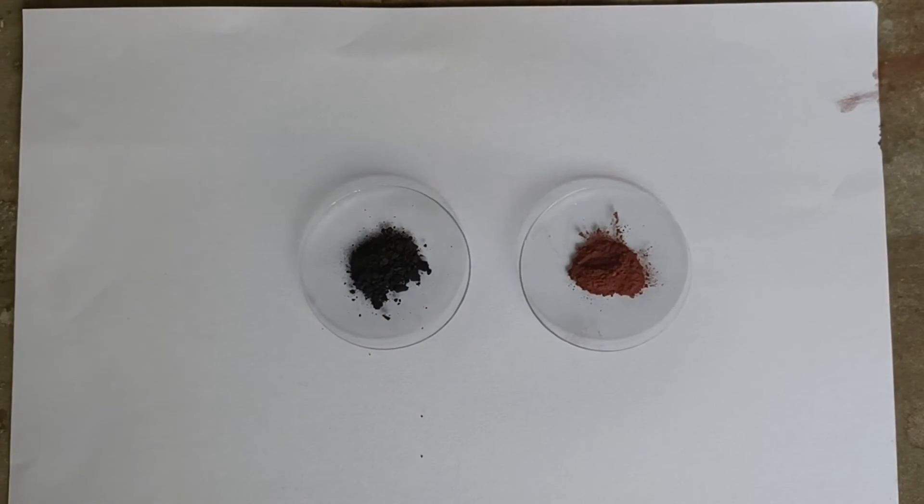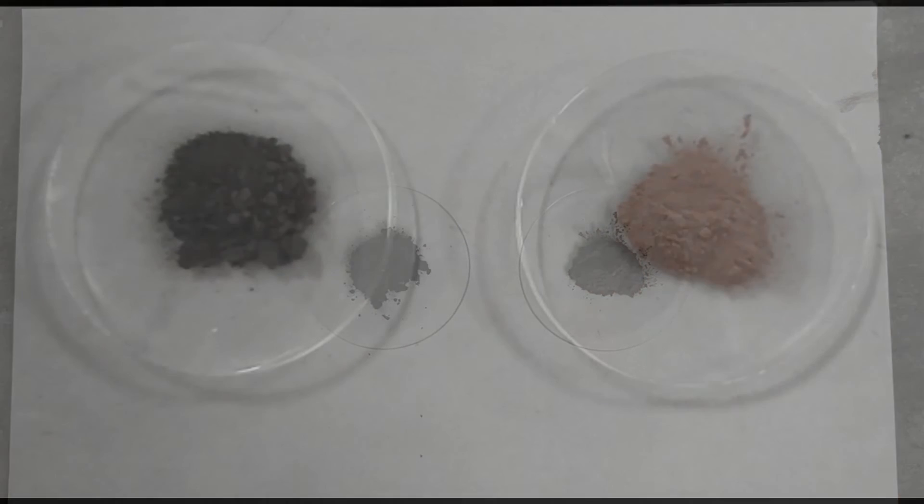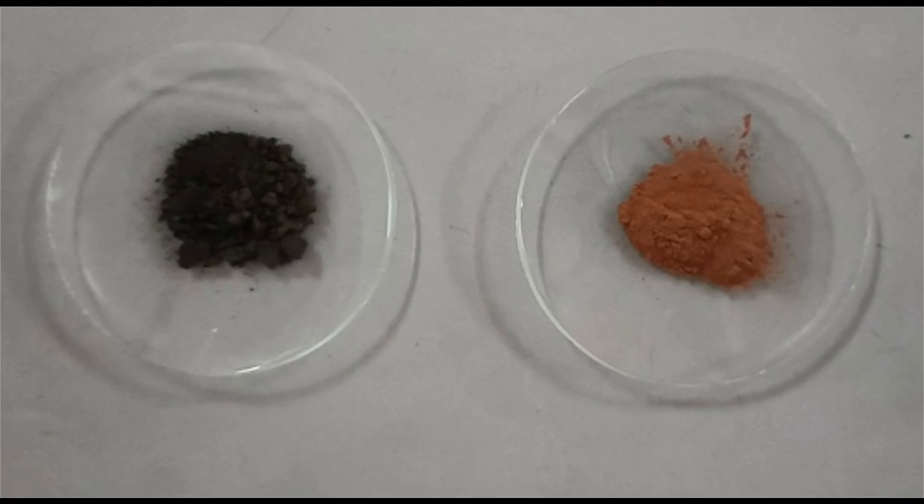You can very well differentiate between the brown color copper powder and the black color copper oxide. I hope this experiment was useful.